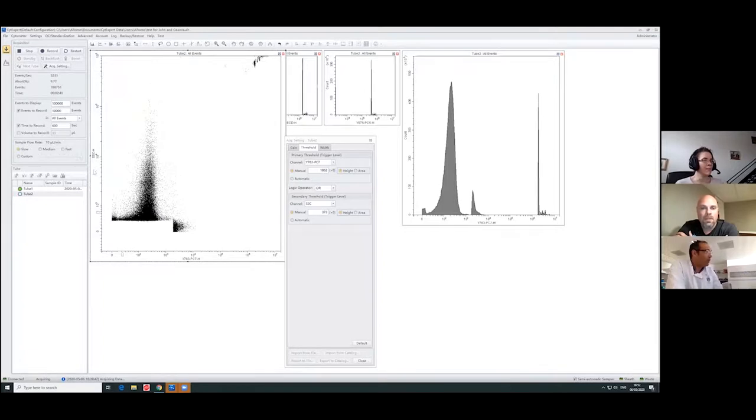Okay. The other thing you asked me about is the speed. You can see at the moment we are at an abort rate of 11. So if I increase to medium flow rate, I'm going faster again. And one of the things you will notice is, first, what is happening with this peak here? Have a look, let's go back to slow. And I restart. Look at your peak if I go too fast. So increasing the speed can increase the CV results, which leads to thicker peaks.